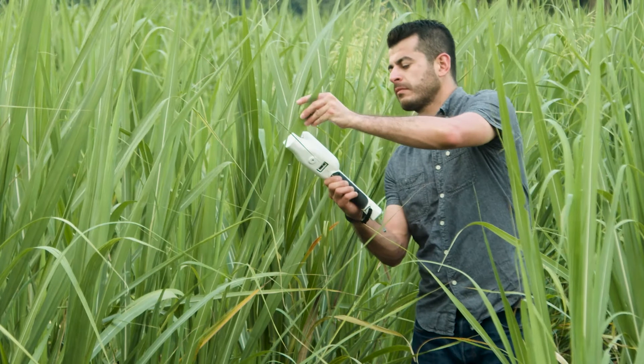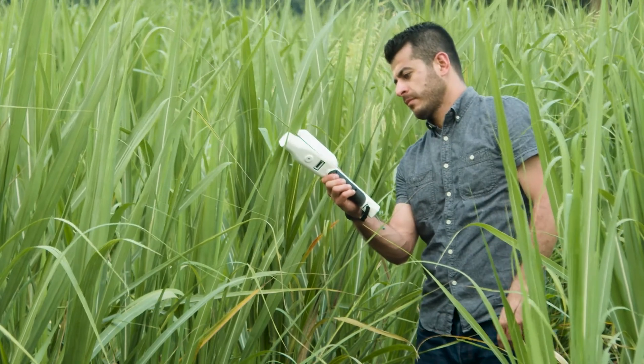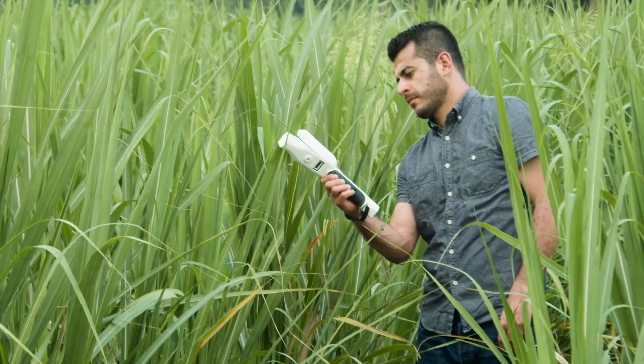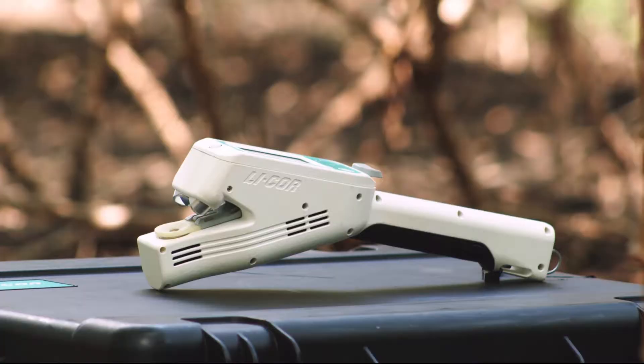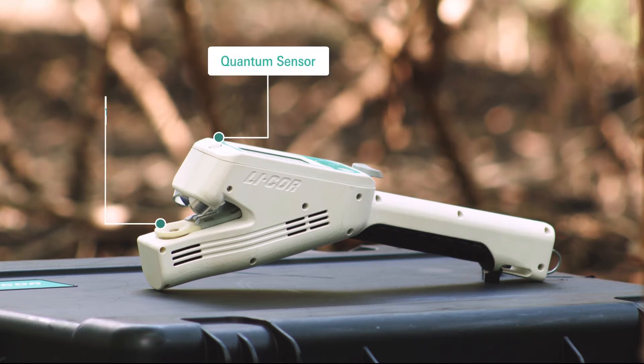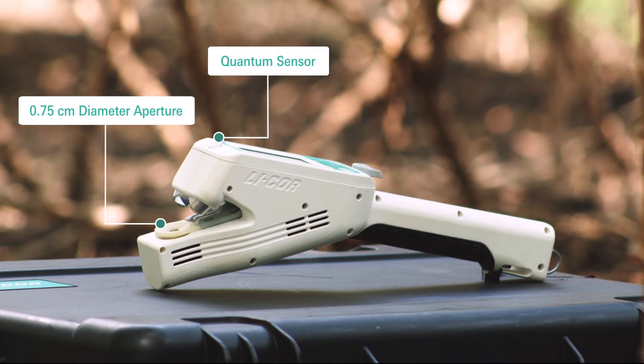No need to spend your entire day or night assessing your plants. You can now dedicate more time toward analyzing your data and making groundbreaking discoveries. Because the LI600 takes measurements at ambient conditions, you don't have to acclimate the chamber, making your routine even faster.